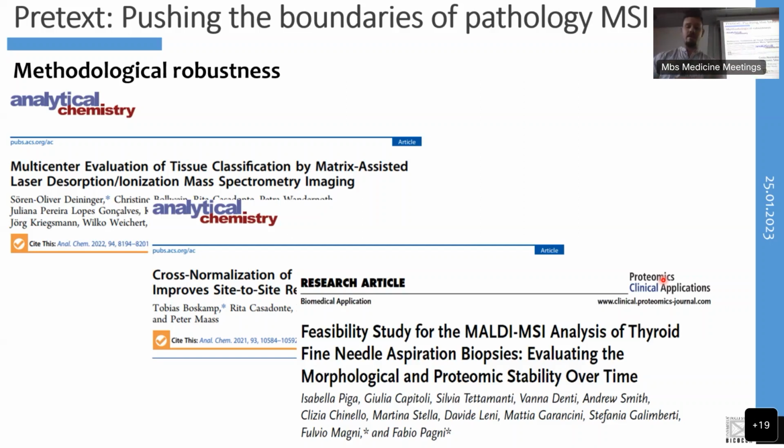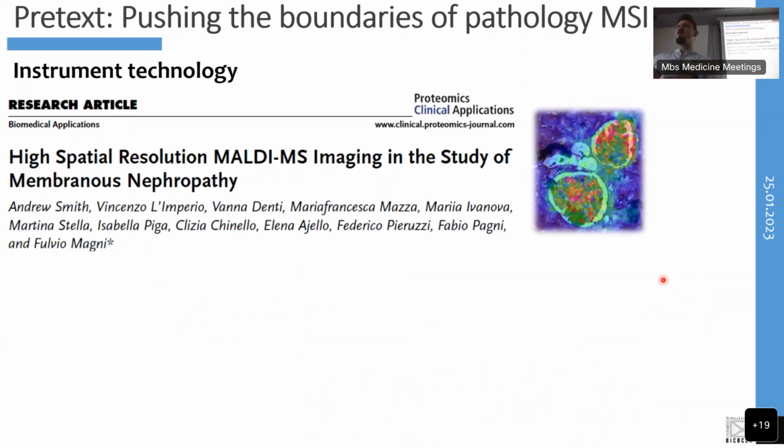Another area where we've seen improvements is in spatial resolution. Of course, now we know this trend toward single-cell omics is exploding again, and mass spectrometry imaging has also followed those lines. Now we have commercially available instrumentation where we can detect single cells based upon the molecular profile, and in some instances, also start to go into the subcellular level. And not only this, but acquisition rates.